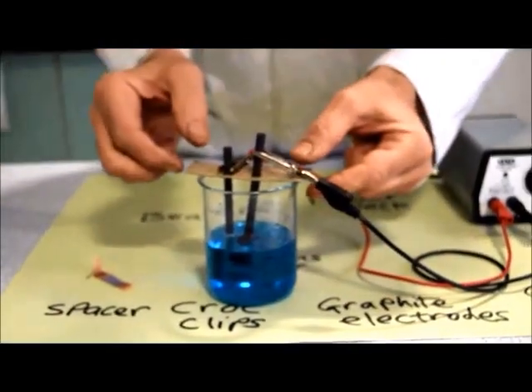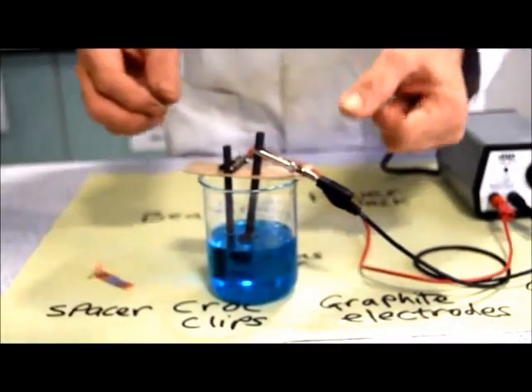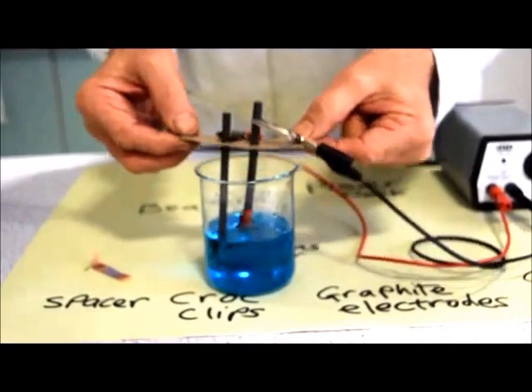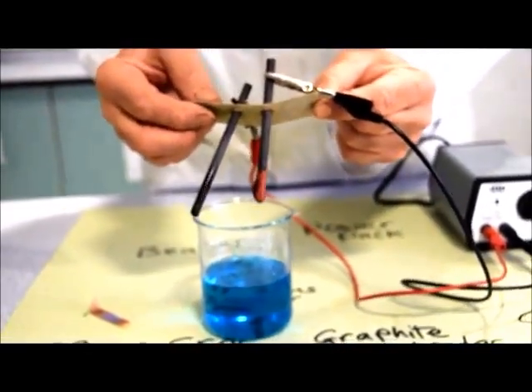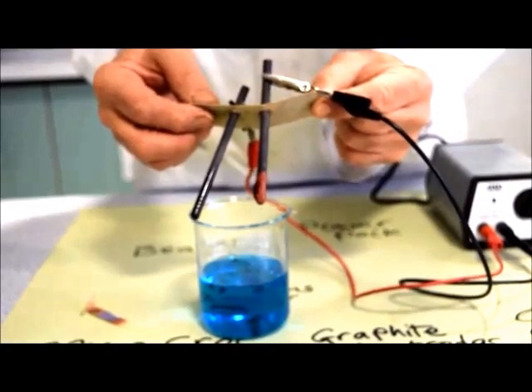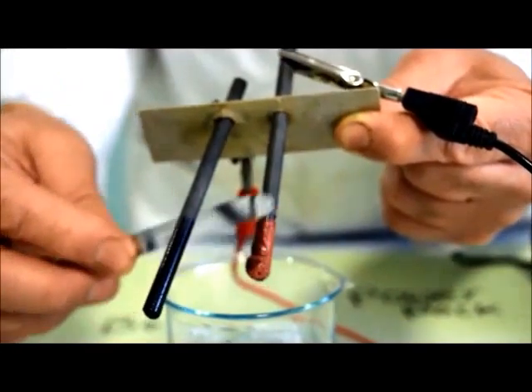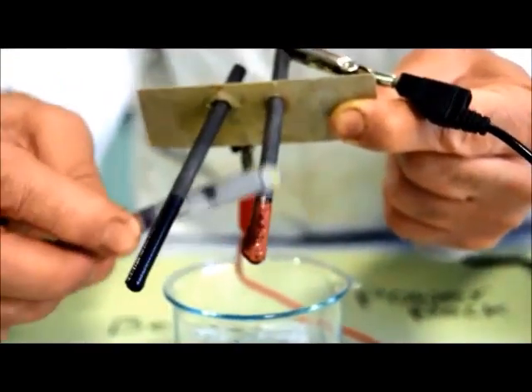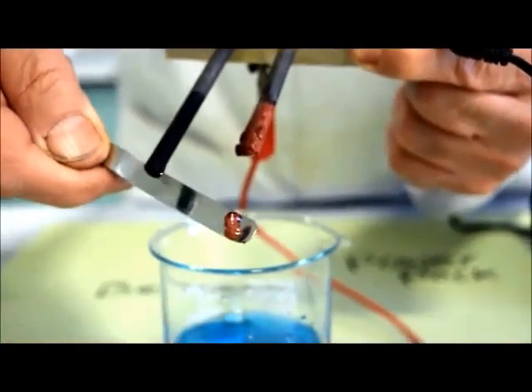After a minute, we turn the power off at the mains and lift the electrodes out. You can see on the negative electrode, we have copper buildup. Using the spatula, you can scrape it and see the copper that's formed.